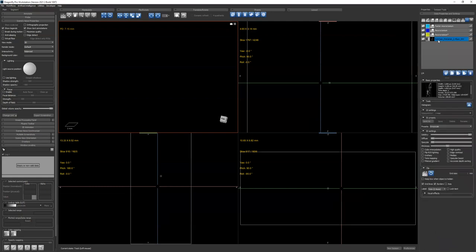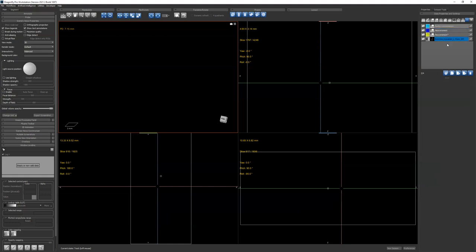So let's say this ORS session got unwieldy and I wanted to take the original data and one of my segmentations. I would use control, select both of them and say export as either multiple ORS objects or as an ORS object, which is a single file. It doesn't matter. Either way, you can open Dragonfly, drag those into it, and then you would have a new session with just those two things in it. And you would get rid of all of your extra stuff. Sometimes you have to do that.